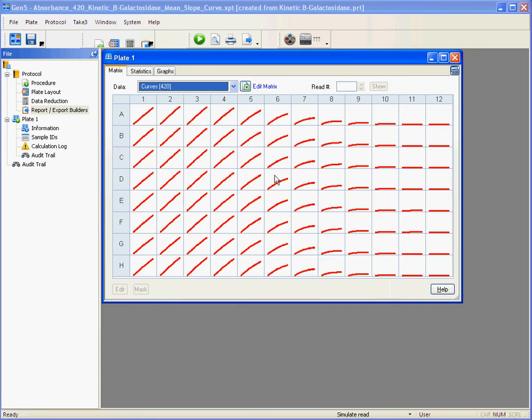In the previous versions of Gen5, there was a limit to the number of curves that you could overlay, and it was set to 8. In Gen5 20, this limitation is gone.